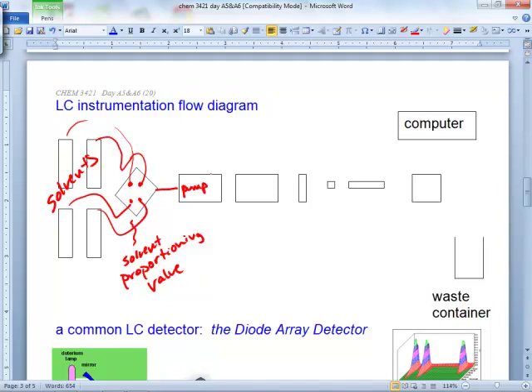Because we don't want to do liquid chromatography, right? Liquid chromatography is like the piece of paper and food dye and just sit in some water. We want to do HPLC, so we need some pressure. So you can have a pump. Now, mechanically speaking, all we know of engineering-wise, this is my pump. That's all I can do, is these pistons.